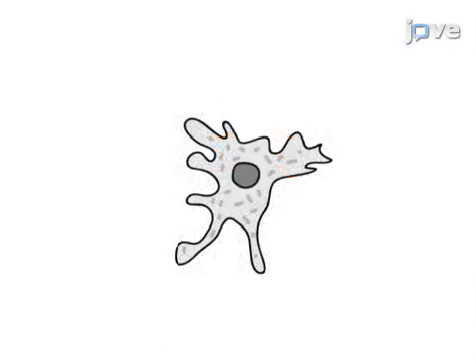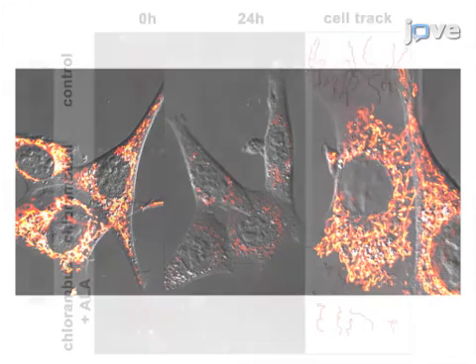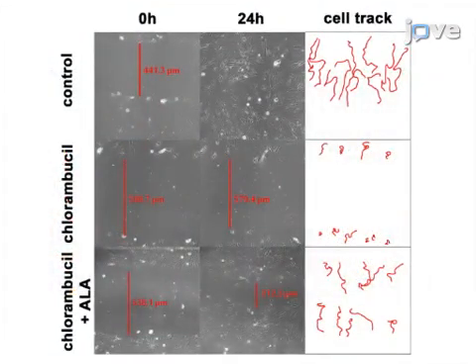In the final assay, investigation of the mitochondrial membrane potential is demonstrated for identifying the underlying mechanisms of impaired endothelial cell migration. Ultimately, these migration assays can be used to evaluate the effects of highly toxic alkylating agents on the mitochondrial membrane potential and migration of endothelial cells. The methods can help to answer key questions in the field of wound healing disorders induced by highly toxic chemicals.